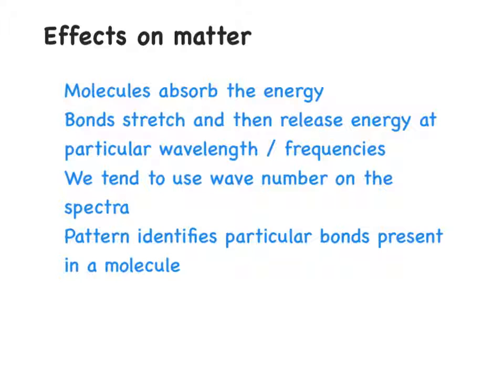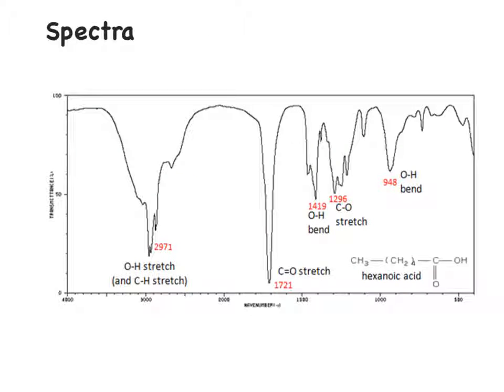So while we're testing this, we don't test it in only one frequency, or wavelength, if you like, of IR. We test it over a range of wavelengths and produce different things. At different input infrared energies, we actually get different outputs that can be detected. So it's a very interesting process. You do it over a bit of a pattern, and we end up with something that looks something like this. And we can see down on the left-hand end, about 4,000 is our wave number there, and numbers actually get smaller as we move to the right.